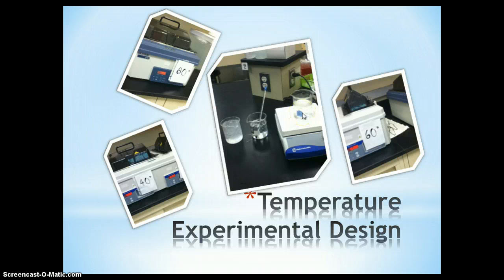We also had 3 other temperature environments. We had 40°C right here, 60°C over here, and 80°C over here.